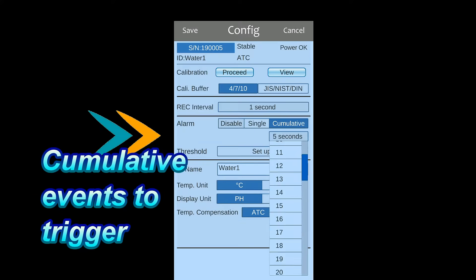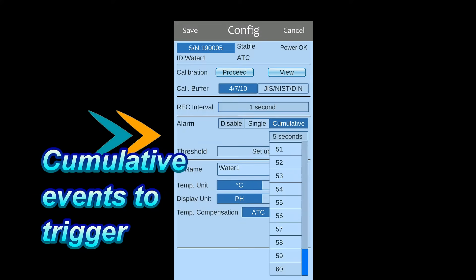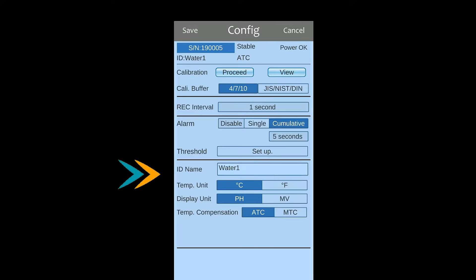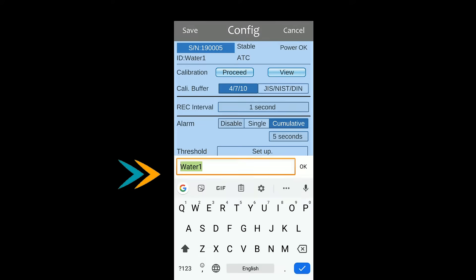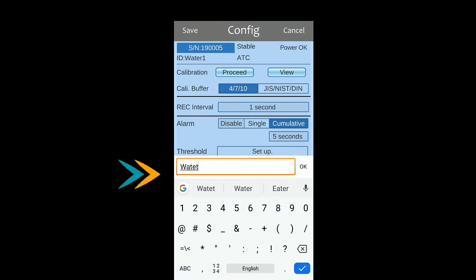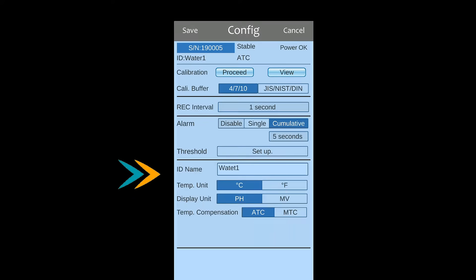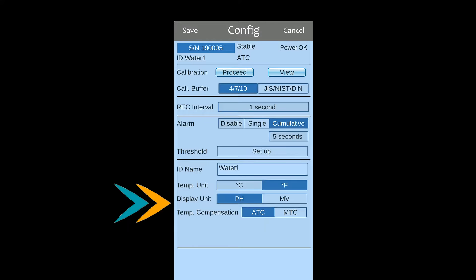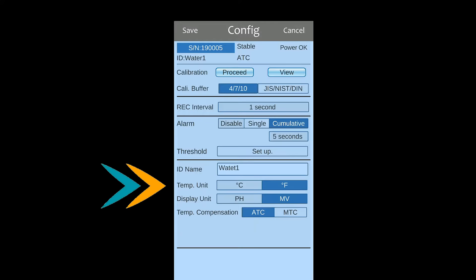While choosing cumulative, select the time. Enter 6 characters as device name. Choose PH or MV as PH value unit. Choose metric or imperial as temperature unit.